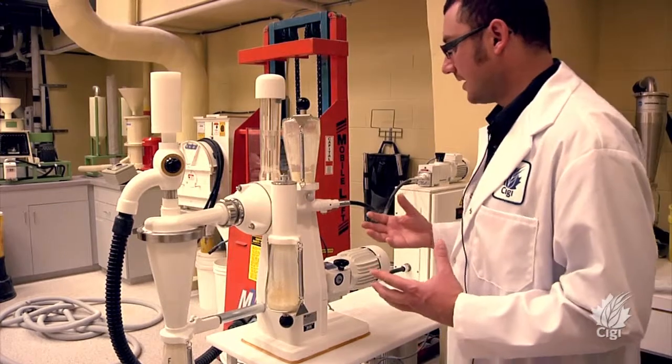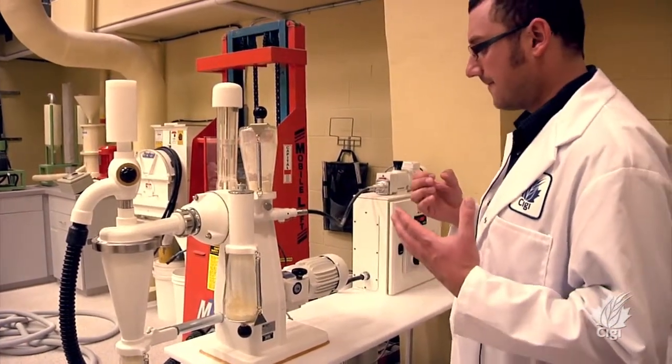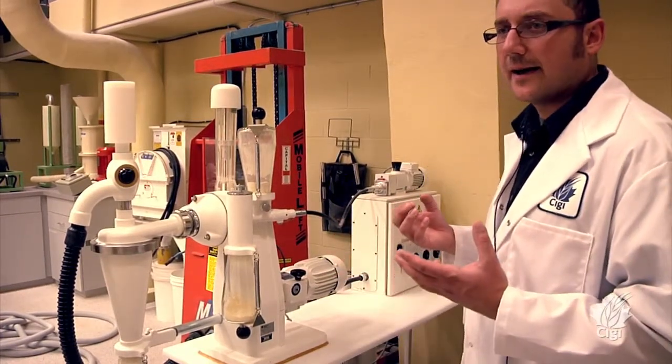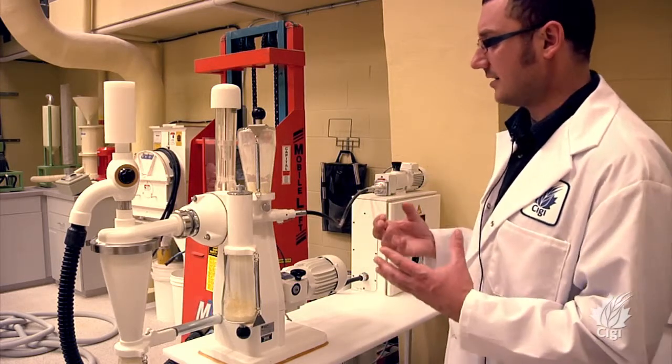The purpose of all this is that there is an emerging market of fractions from flours. Fractions from flours have unique functional characteristics as opposed to a regular flour.